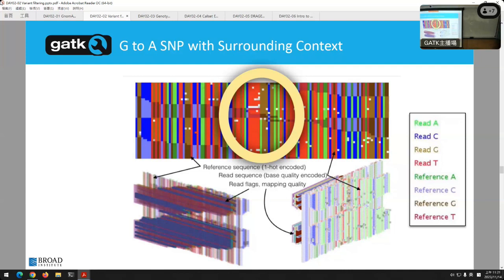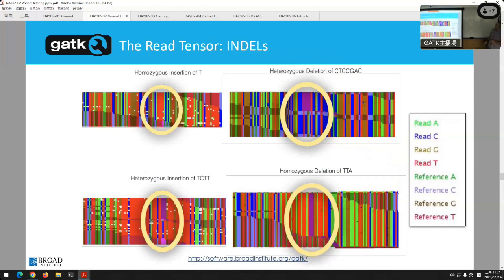It can learn deletions. So insertions. So an insertion of a T, for example, this pink thing here means there's nothing in the reference genome, and there's a red, T is red in IGV, there's a red line here. It is learned within the whole sequence right here. This is all the reference. And at this position here, where there's nothing, there's a T. So these are all channels. This is all a 3D deep learning channel, tensor, that you can see actually insertions. And you get similar things over here with deletions. There's nothing in your sample where there is stuff in the reference. Okay? So I hope that was crystal clear.